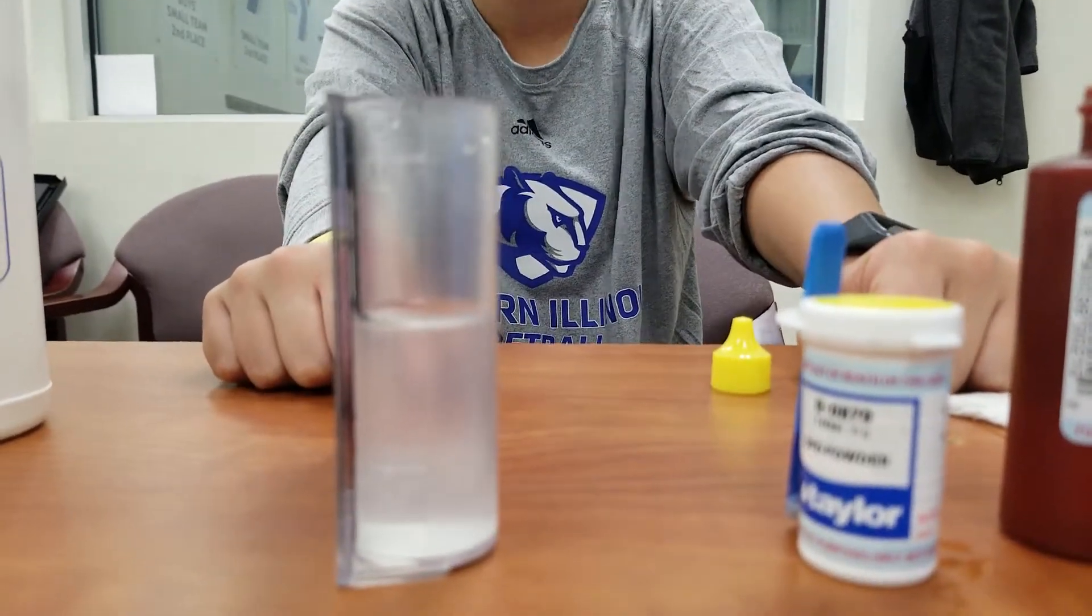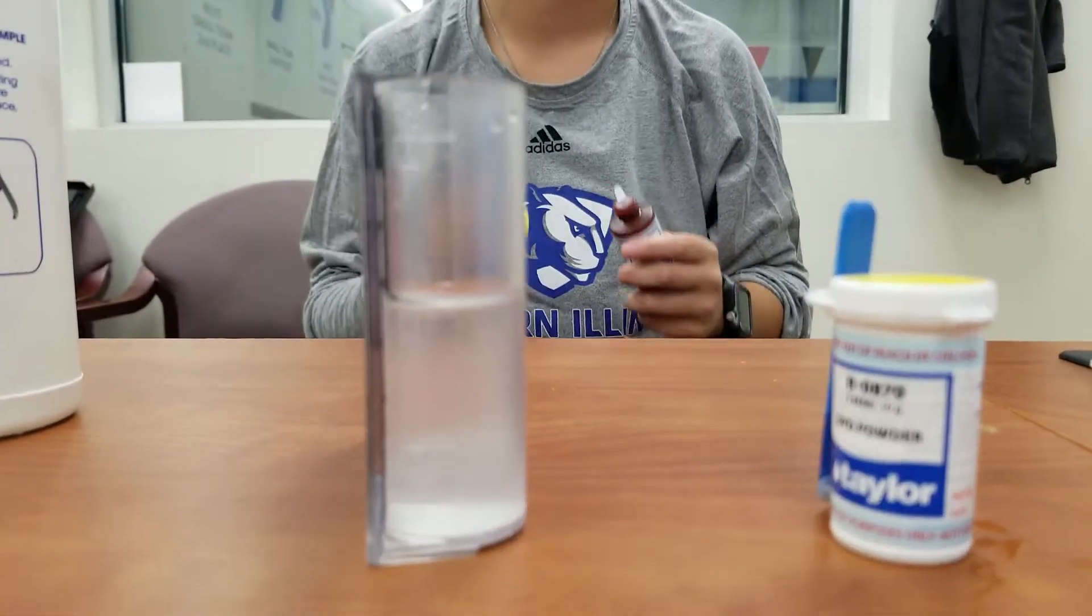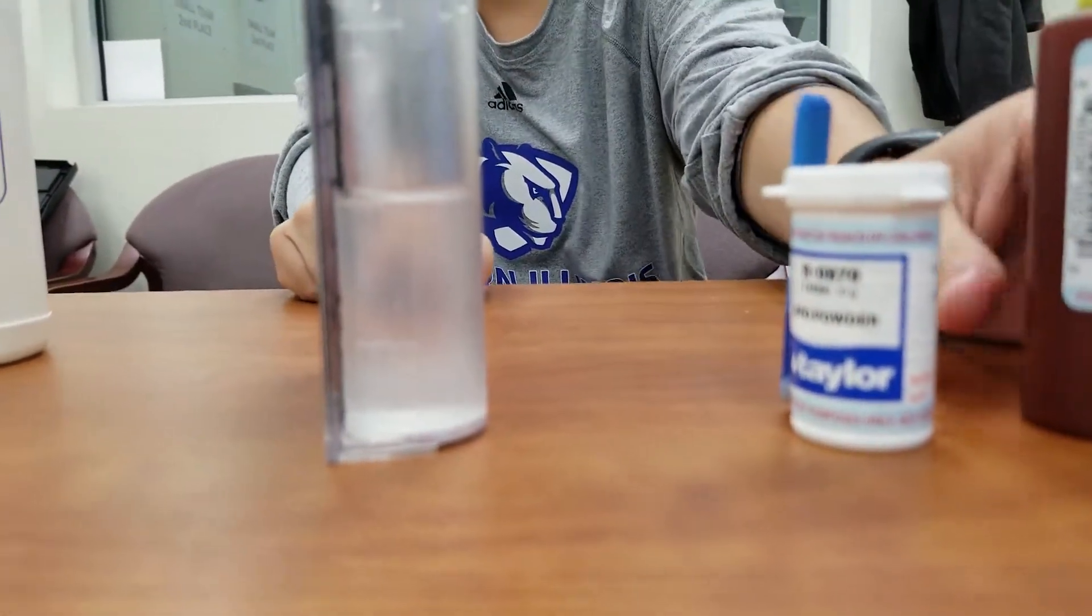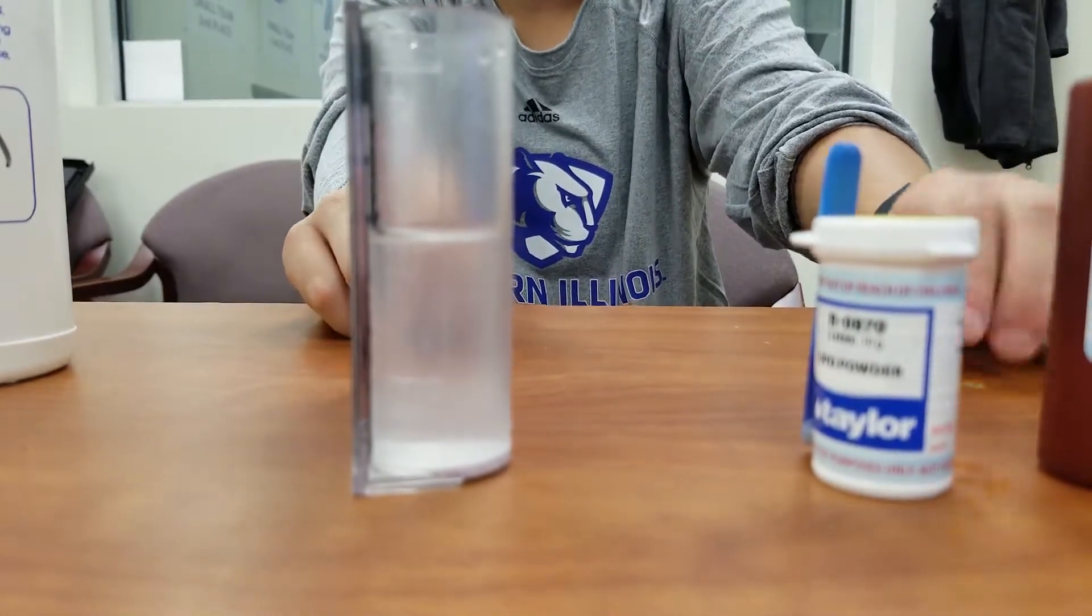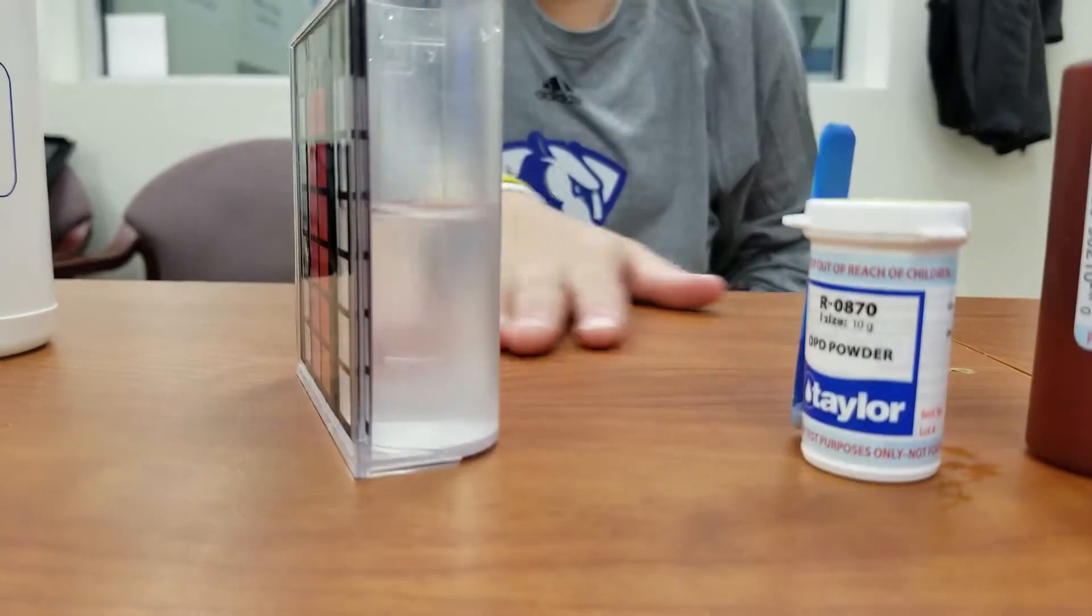What do we multiply that by? 0.2. So that is going to equal three. So that means currently our free chlorine is at 3.0. It's easy to remember, for every five drops it's one full ppm of chlorine.